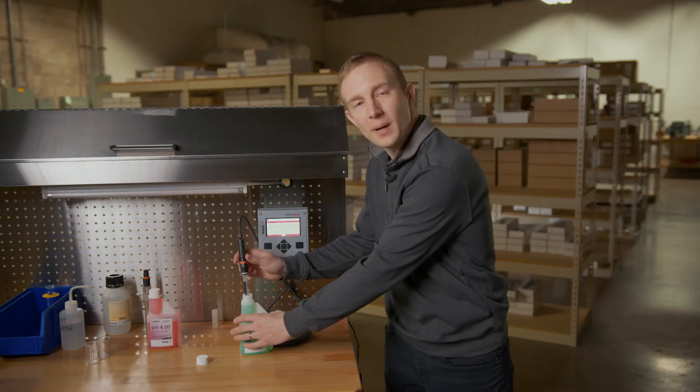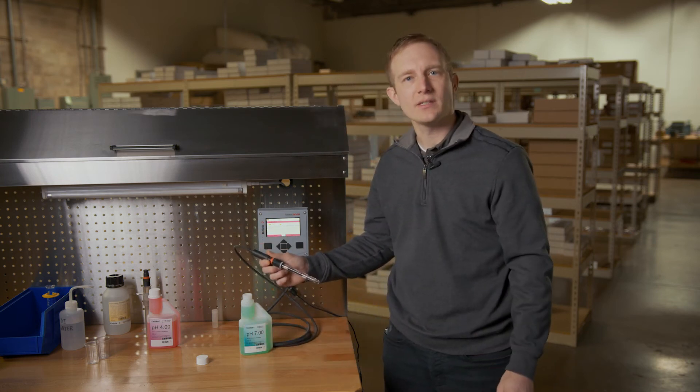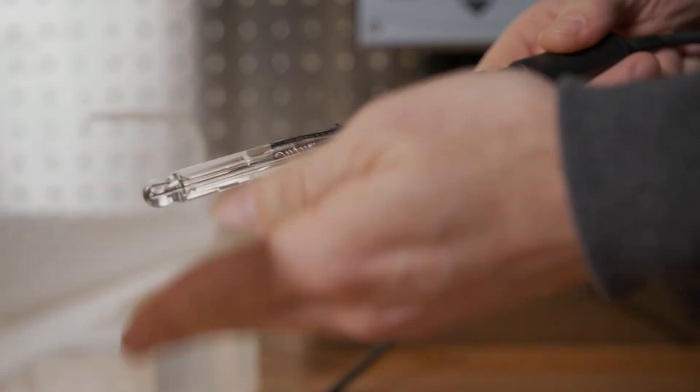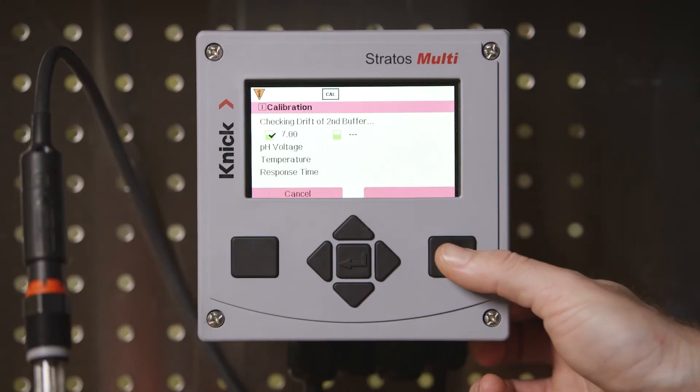Once finished in the first buffer solution, the transmitter will prompt you to again rinse the sensor and immerse it in the second buffer. We will do so and place our sensor in the buffer 4 solution. Again stir lightly and press next to proceed.